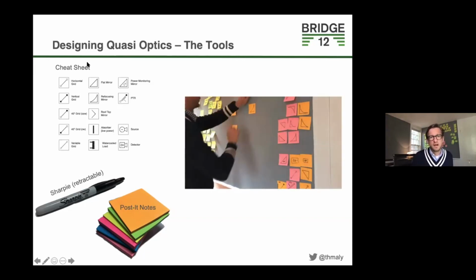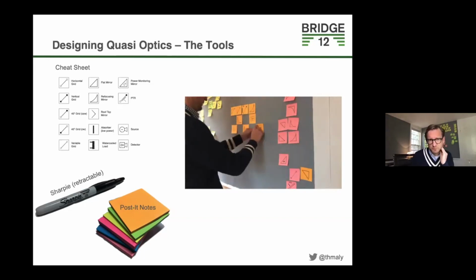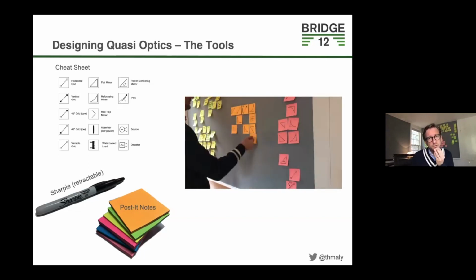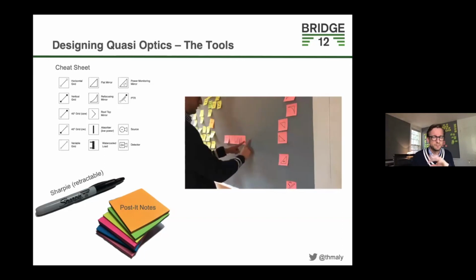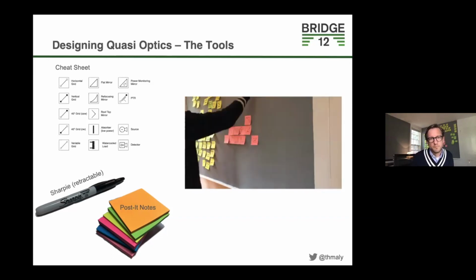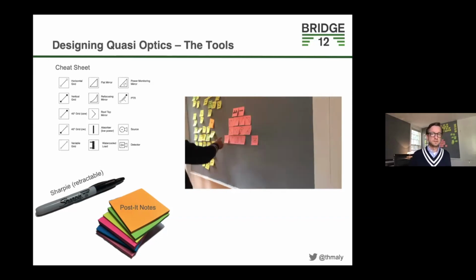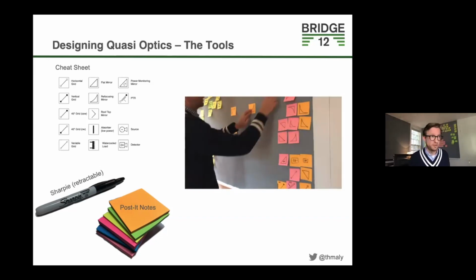Here at home, I'm sitting there, and then this is a standard duplexer for EPR that you can put together and make sure you have all the distances right, or this would be a power splitter here, or attenuator, sorry, that you can use in a Gyrotron-based system, for example.